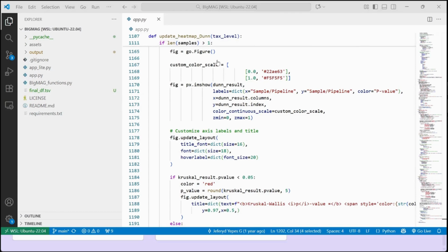Questions? Is it clear? Something that you want me to show? Maybe something that you saw on the dashboard that you would like me to clarify?